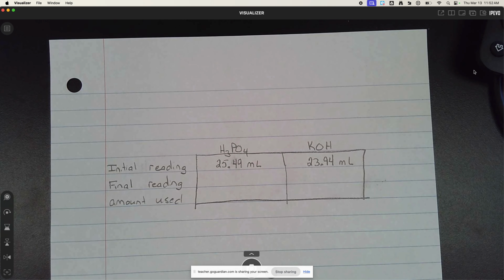If I have leftover base at that point, let's try it again, using a little bit more acid and a little less base. Use the phenolphthalein to check it, and that is definitely a valid thought process. It's kind of slow, it's tedious, but it will definitely get you there if you're just using the phenolphthalein to try to figure out what's the exact ratio to use these up.